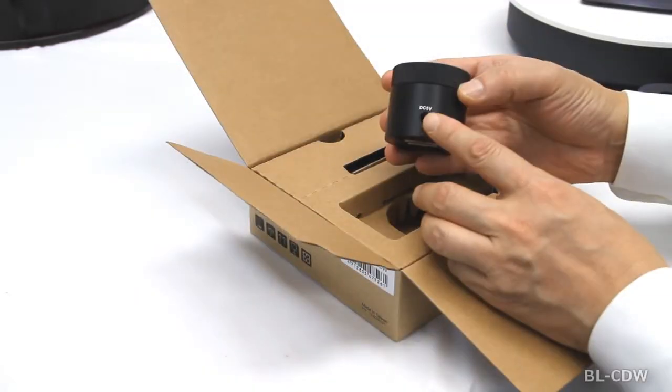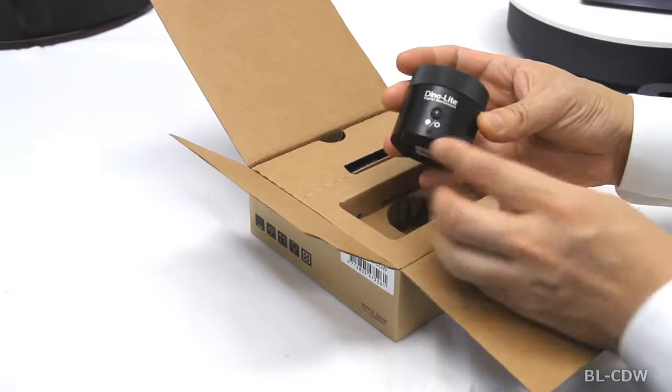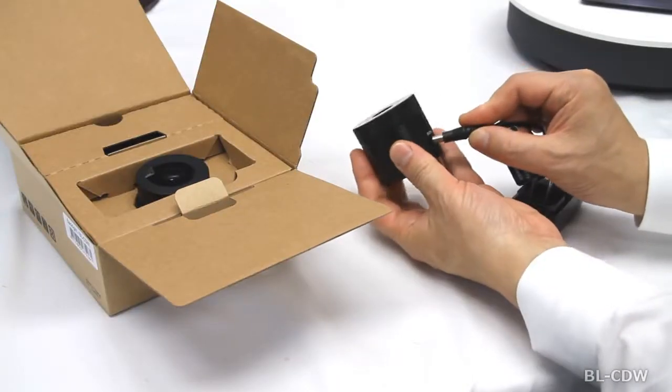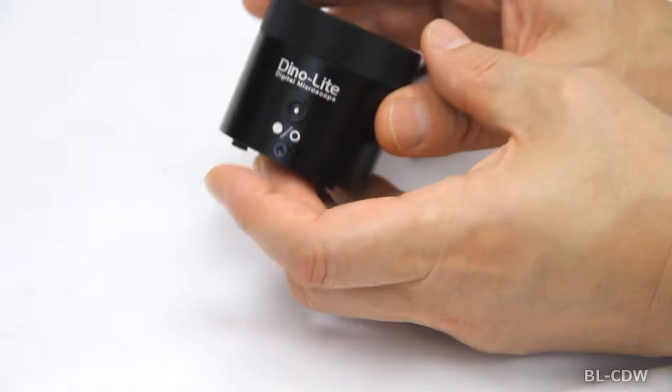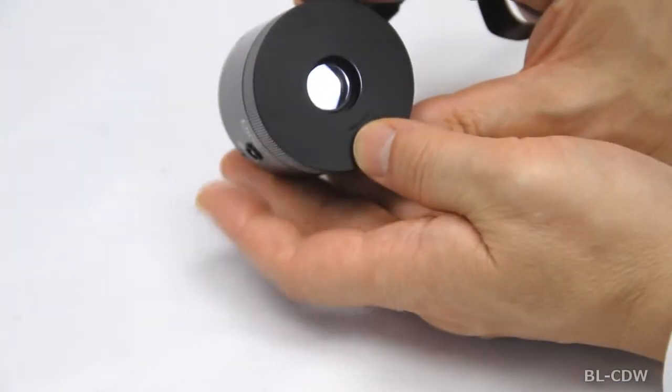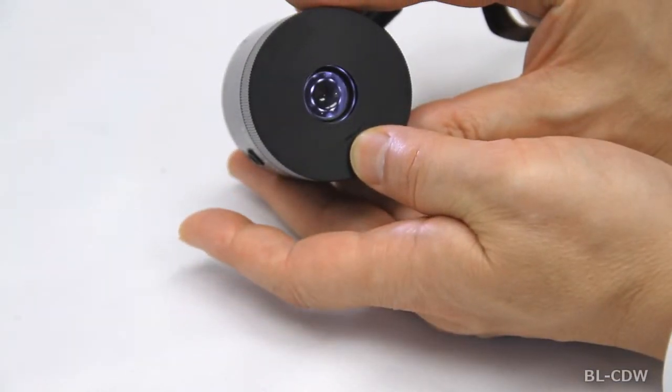This backlight illuminator is powered by the included AC adapter. The mode switch on the front of the BLCDW changes the output between bright field and dark field illumination.